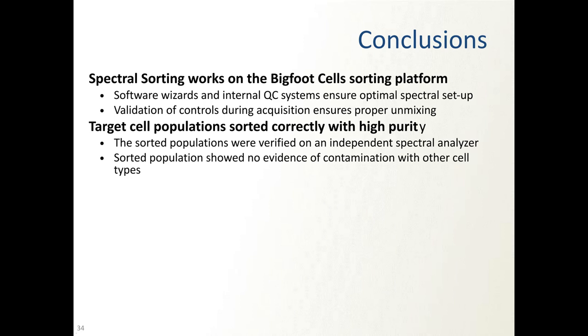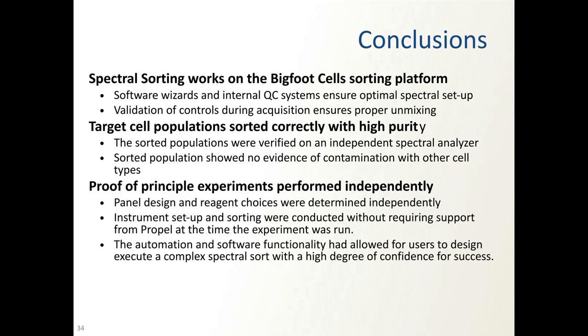Now, here's the not pretty side of where we're at right now. I'm sorry, no, that comes next. Scratch that. Proof of principle experiments were performed independently. Panel design and reagent choices were determined independently. The instrument setups were just done by us. I basically sat with one of my sort operators and the postdoc, and we did it. We didn't have an army of support people and applications people holding our hands. It was done by us.